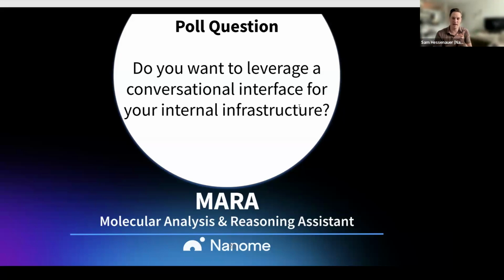We are also expanding a lot of our capabilities in our data table support, where I can use natural language to interact with this data table, while it's adding columns or new rows or doing a very simple analysis, and leveraging tools to get there. We'll be expanding that a lot more in the coming month or so, such that it's really easy to do SAR analysis using natural language. I think that's going to excite a lot of chemists. So there's a lot you can do with it even right now, but in the next month or so, it's going to be really exciting. First of its class.